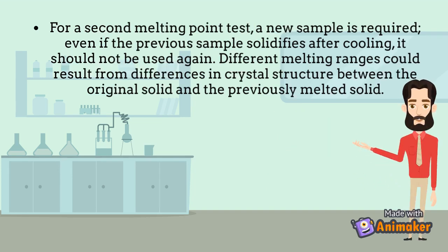For a second melting point test, a new sample is required. Even if the previous sample solidifies after cooling, it should not be used again. Different melting ranges could result.